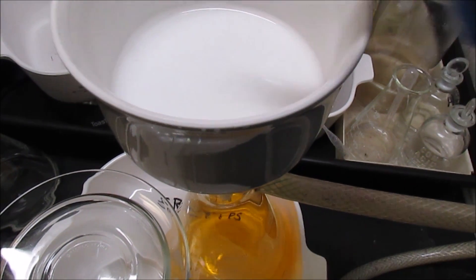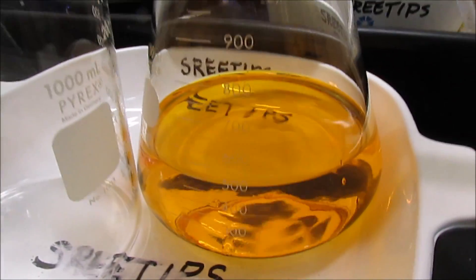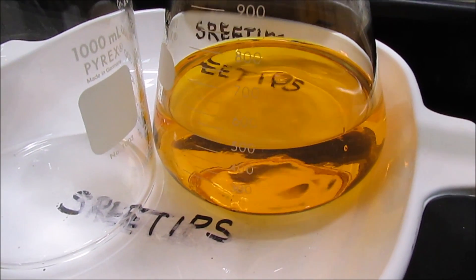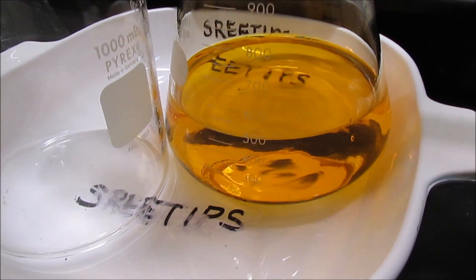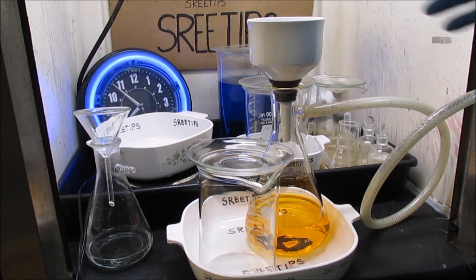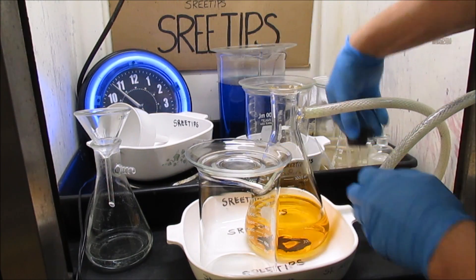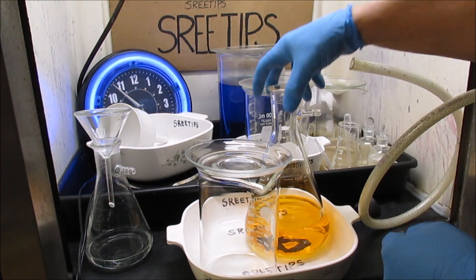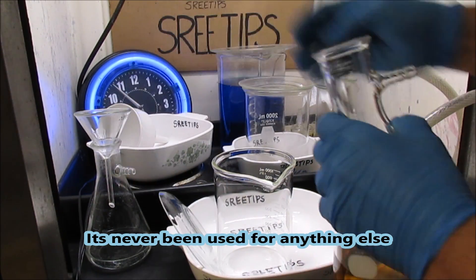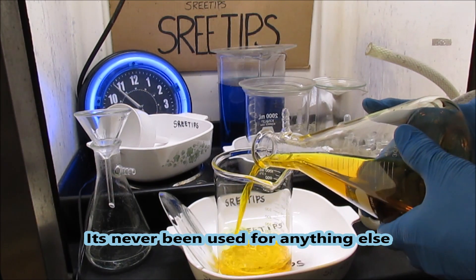I've rinsed all the color out of the filter, and the extra water going through into the solution hasn't produced any cloudiness whatsoever — this is going to make some real high purity gold. The filtering operation is complete. I'm going to pull the filter off. I've got a beaker set aside specifically for precipitating pure gold — it's a real clean, pristine beaker, never been used before. I'm going to transfer the solution into my precipitation beaker.